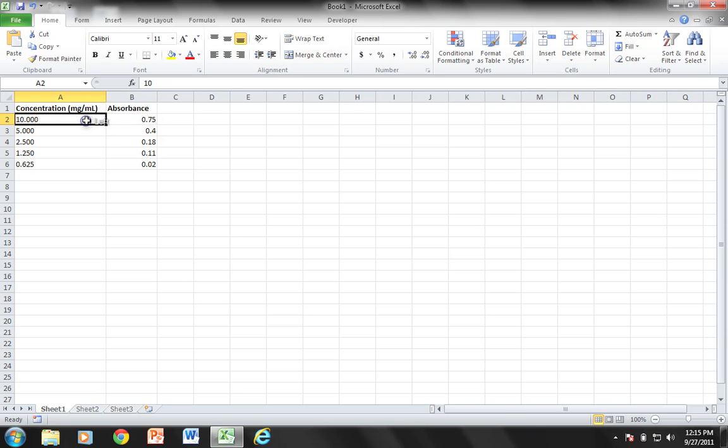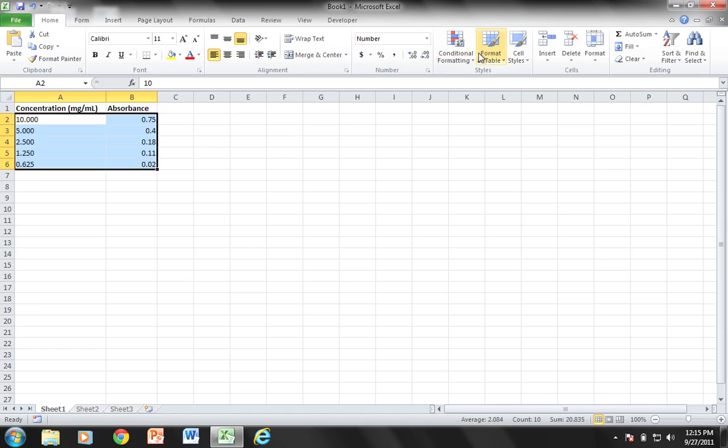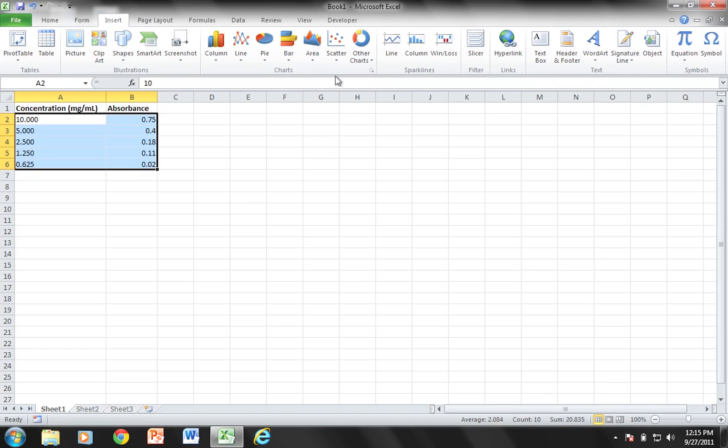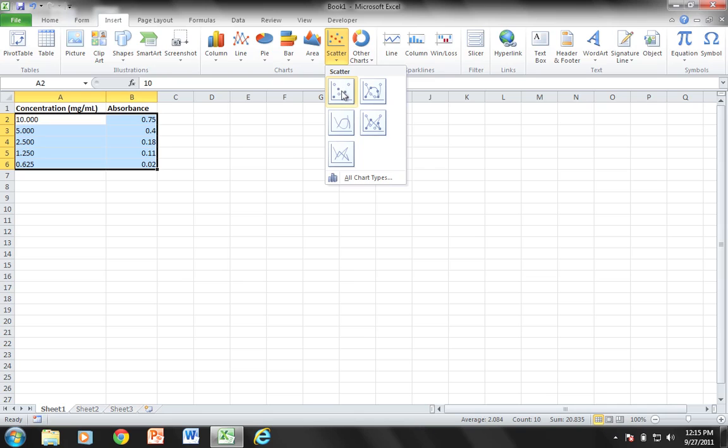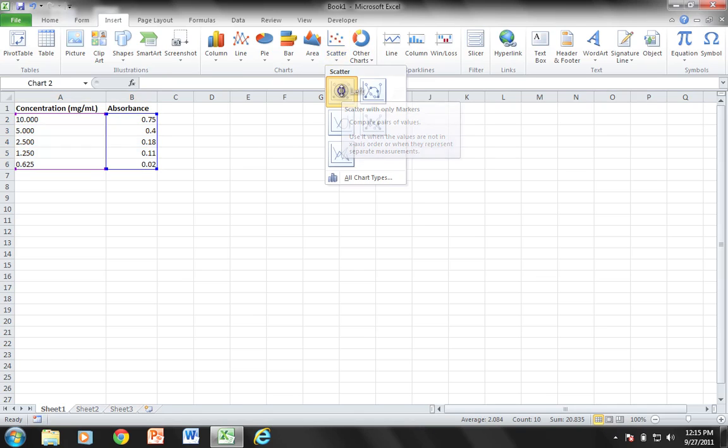To do this graph, I'm going to highlight all of my values and come into Insert. I'm going to choose Scatter and then choose this first scatter type, scatter with only markers. That gives my graph.